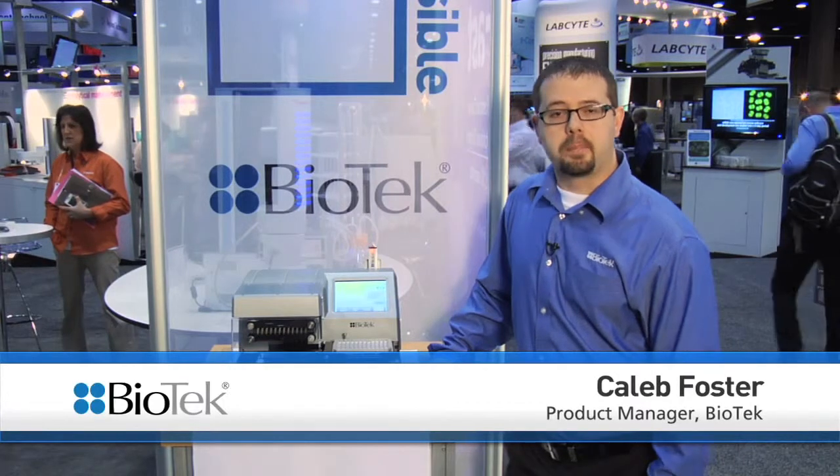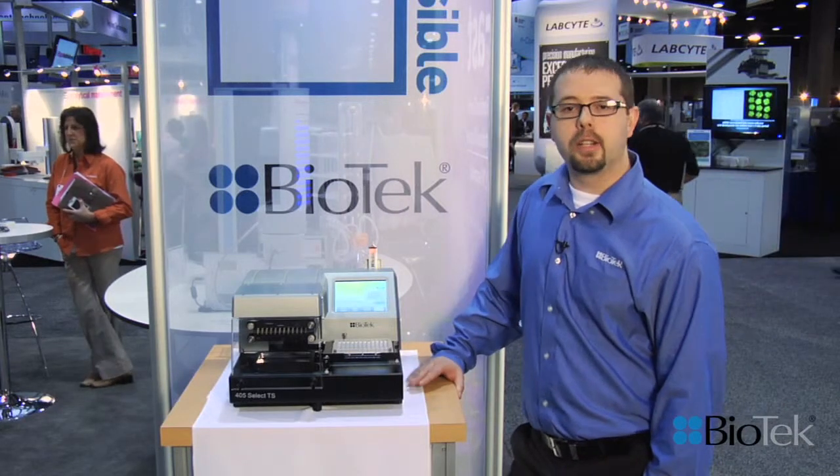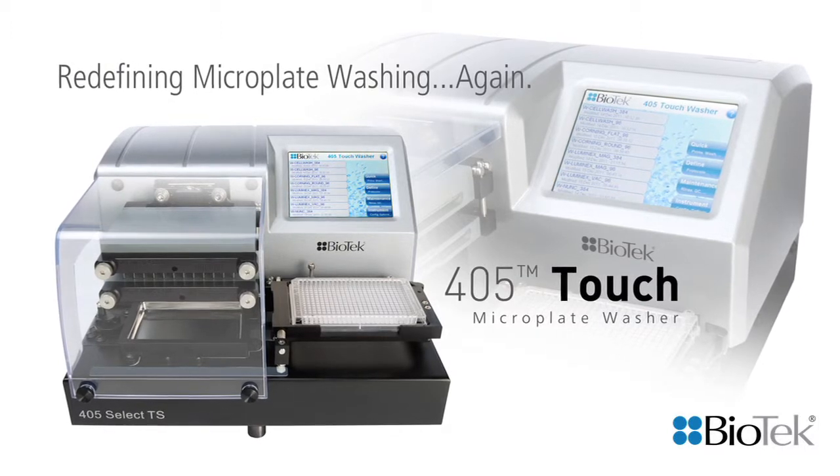Thank you for joining me at the BioTek booth. My name is Caleb Foster and I'm a product manager in development with BioTek Instruments, and I'm here today to introduce you to Verify Technology, our latest tool for the 405 microplate washer.